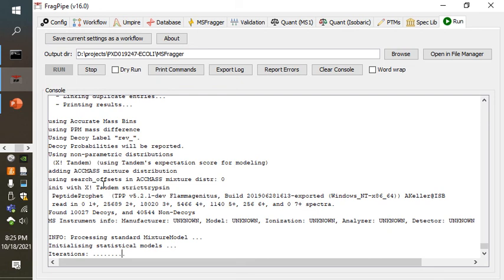The software knows that things that have mass errors closer to 0 tend to be more likely correct than those that are closer to 20 ppm in error. And so the software is able to use that as something that the scoring engine itself isn't contributing, but that it itself can detect as a useful discriminant between correctly identified PSMs and falsely discovered PSMs.